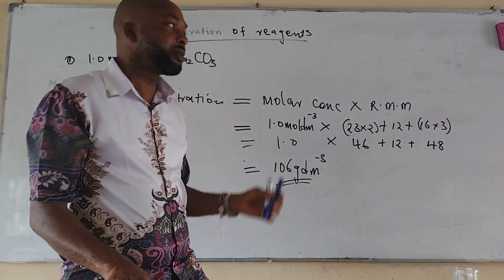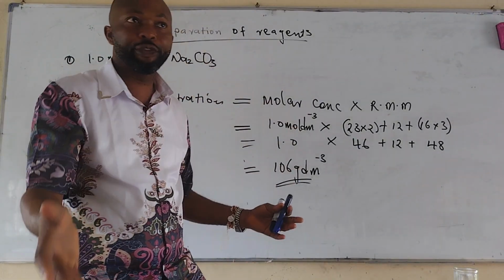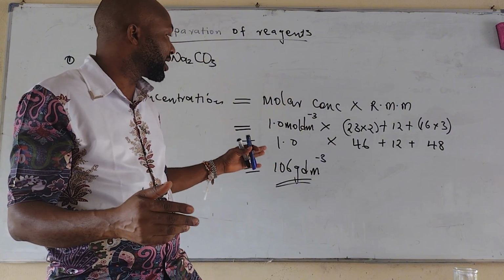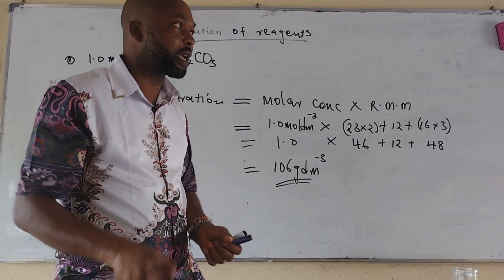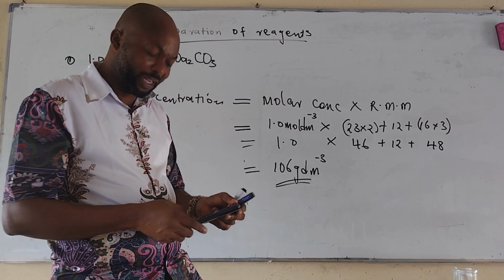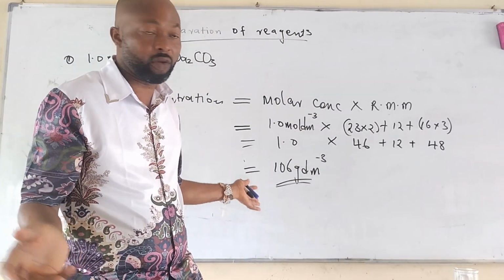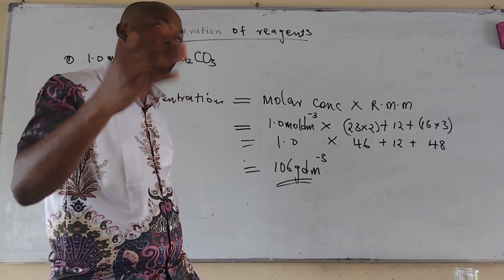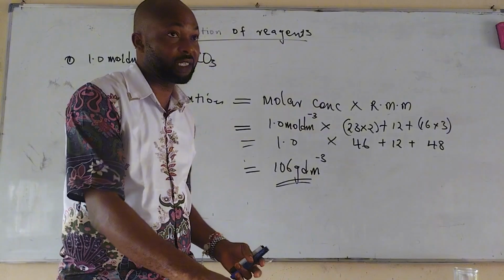You divide it by 4 so that you can dissolve in 250 ml, to save the reagent. To measure 106 grams of a particular reagent is a whole lot, and that may cost us much. Or you divide the 106 by 8, which would be 13.25 grams, which is reasonable. We dissolve that in 125 ml. That makes much sense. So that is how the trend goes.